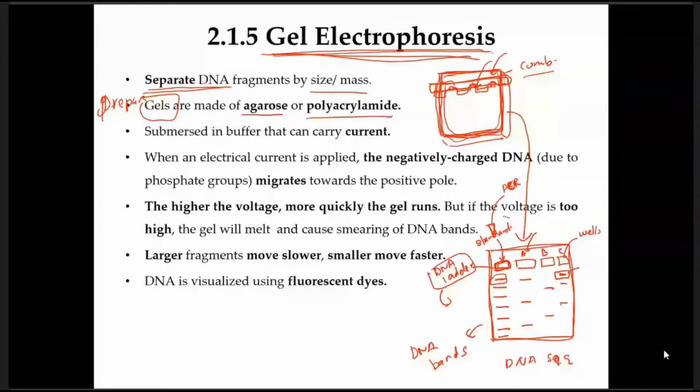Okay, so yang atas ni size dia berapa, yang bawah size DNA dia berapa, yang tengah size DNA dia berapa, by comparing to the DNA ladder. Okay, so the gel that you prepare, before you insert your DNA sample, you must submerge the gel into a buffer, okay, that can carry current.